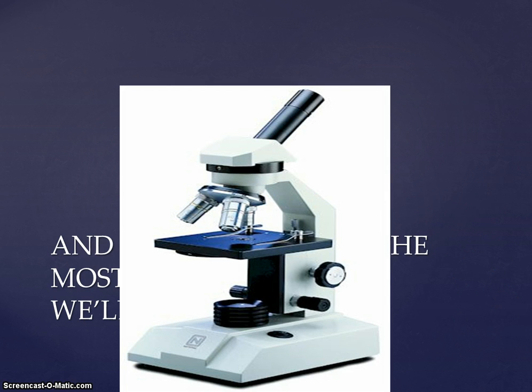When we say it's a light microscope, that's pretty obvious, because you have to have a light that will shine beams of light up through the image that we'll see here. And if you remember, there's my creepy little eye. We'll be looking through this lens here, and through a series of lenses up here, it will actually magnify the image that we can see. So the light component is pretty obvious.